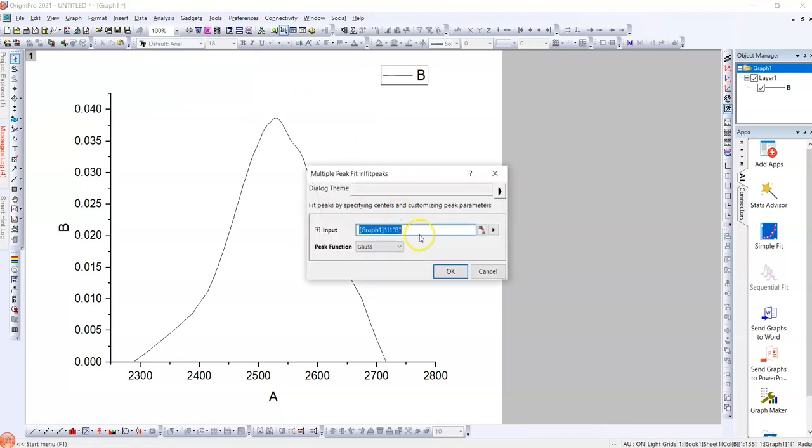For that, we have to go to Analysis, go to Peak and Baseline, and then Multiple Peak Fit. After multiple peak fit, there are several values. We choose the Gauss one. This is Gaussian distribution, a significant quantum term by which we can deconvolute or evaluate when collective peaks are there and we would like to show the individual ones from the collective peaks.